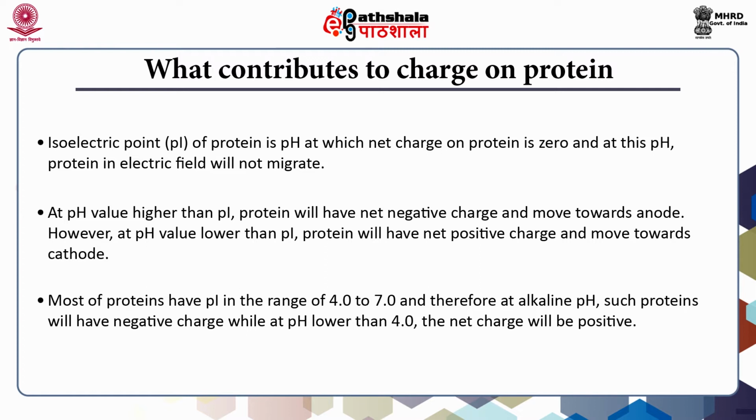The net positive charge will gradually decrease with gradual increase in pH, and then charge will reach 0. Further increase in pH will result in net negative charge, which will continue to increase with increase in pH. Also, it is made clear that net charge on protein will continue to increase as one moves away from its pI value.